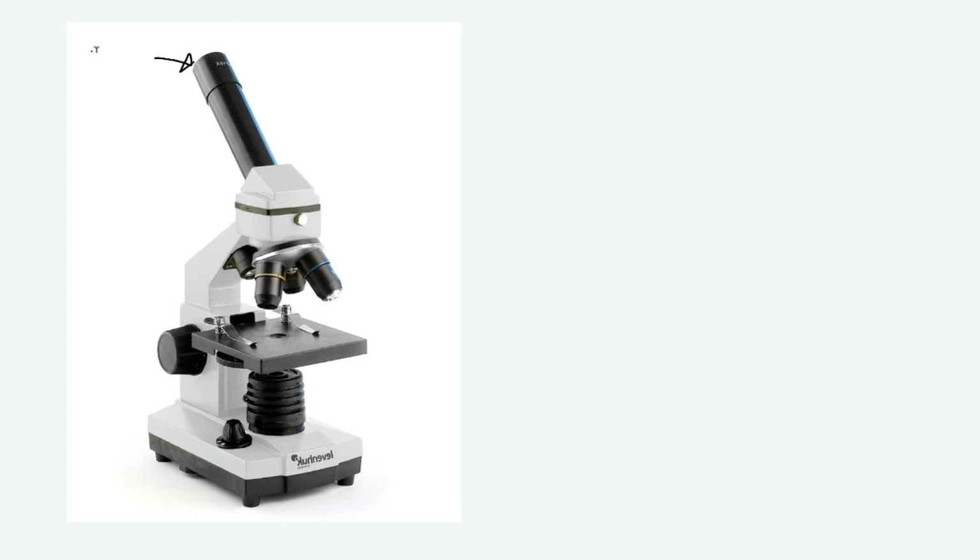So first here we have the eyepiece. This is obviously where you are going to be looking. You look down it with one eye, that is the eyepiece. Here we have the adjustment knob. You do see these things named differently, but the adjustment knob, basically, you can twist it and it causes the stage, which is this, to go up or to go down. So you lower it or you raise it up, depending on what you need to do.